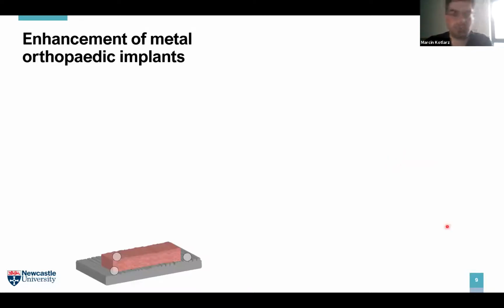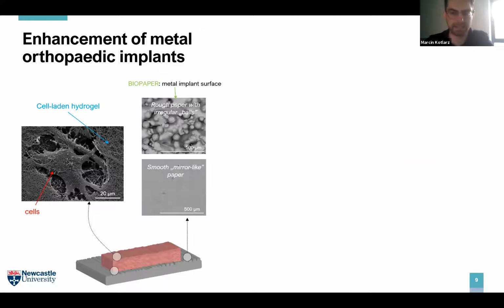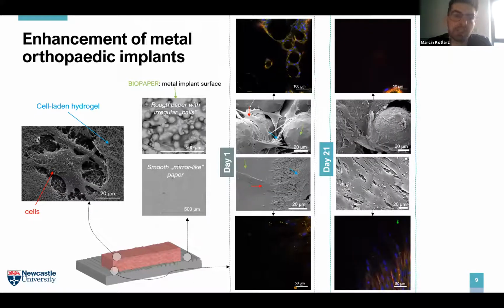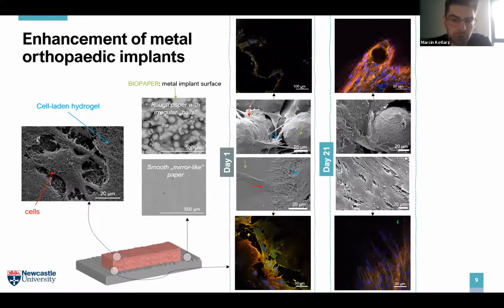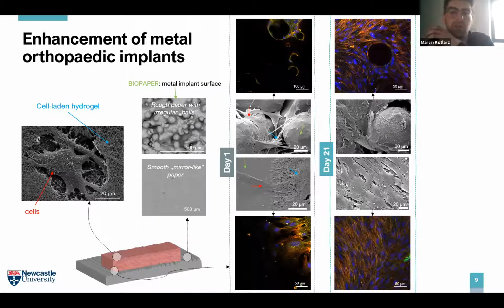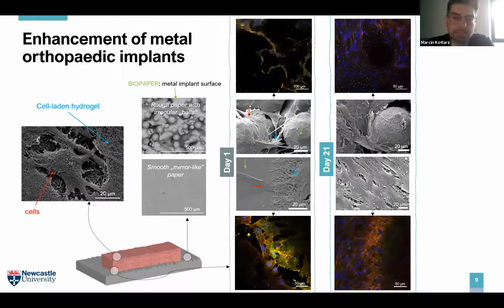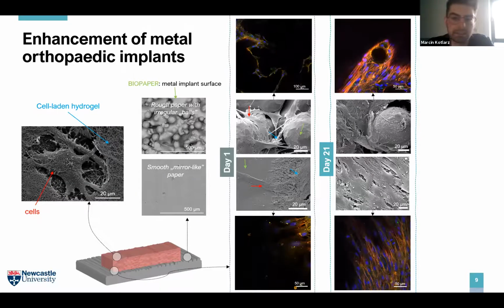Another idea is actually to use bioprinting to enhance metal implants with patient cells to make the implants more bioactive. In this experiment, we investigated the response of bone marrow stem cells to metal biopapers with different surface characteristics. We checked at different time points the interaction between cells and the implant. For instance, if the stem cells developed into mature bone, and how the cells organize depending on the biopaper landscape and day of experiment, using 3D confocal projections.